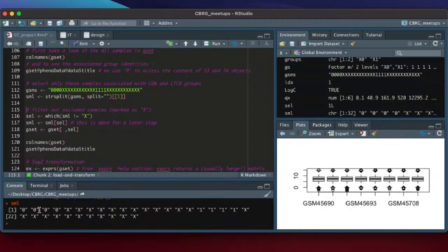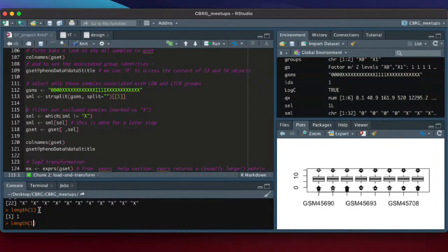I guess my question is, is it always a 1 though? Does that 1 actually signify something? It depends on your split parameter. In case you can see, there are actually 32 here. You can have as many as you want. You can think of it, Paul, correct me if I'm wrong, as multiple slots. It depends on the split. If you split, for example, for 0, you will obtain a list of 2. If you split for another character, you will obtain a list of 1 or 3, or whatever. Oh, okay. Then you have to select.